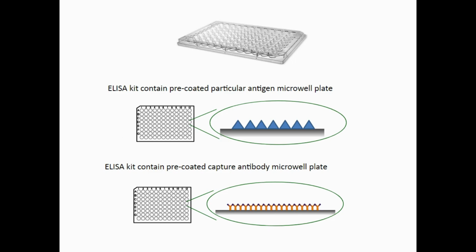For that particular antigen, the animal's immune system makes antibodies against it, which were originally primary antibodies, right? These newly formed antibodies from the animal species are then collected from the serums and are used in the process of ELISA. So this is the main difference between the primary antibodies and the secondary antibodies.